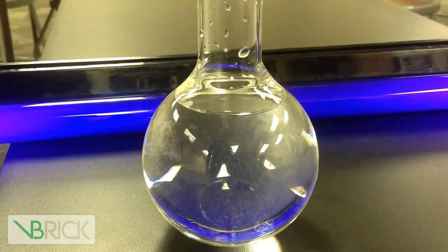The first test we're going to do is without the black light, and the second will be with the black light. And enjoy.